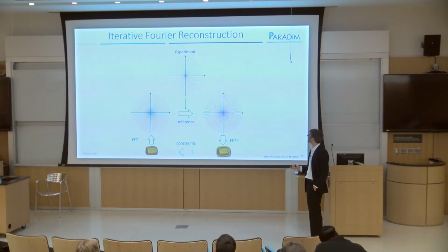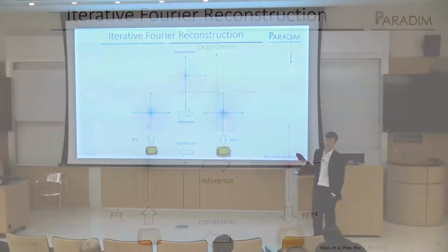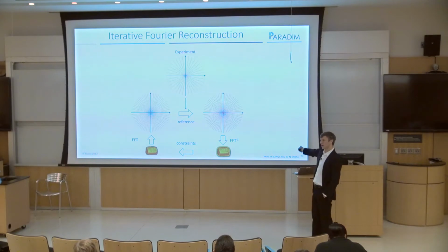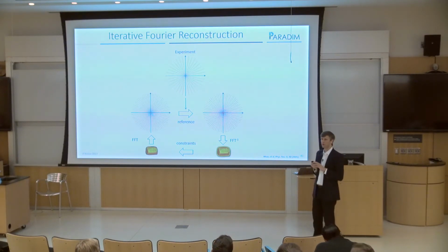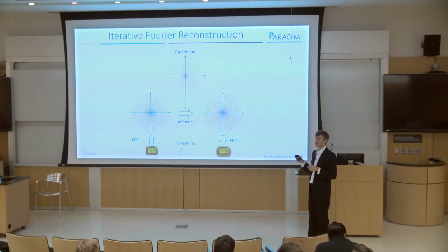Okay? So there's another process, though, called the iterative Fourier reconstruction. All right? So back projection, the radon transform applies everything in radon space, or kind of real space, quasi-real space. There's no Fourier transform involved. But now, I said there are new algorithms that can take care of these problems that I said exist with doing direct Fourier interpolation, okay? And that's these iterative Fourier reconstruction techniques, which you'll now read about in the literature. This is what people are talking about.